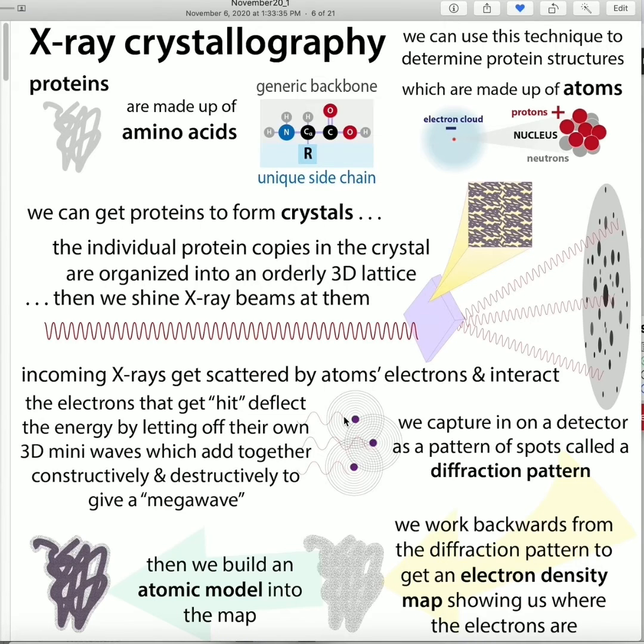You have a set of geometric rules like move up this far, move to the right this far, turn this far, and then place a brick, and do that again. It's a repeating pattern where if you know what's within any one unit, then you know what's within the entire crystal.